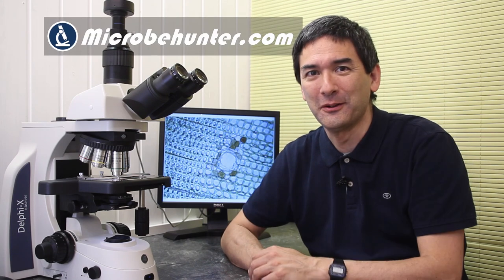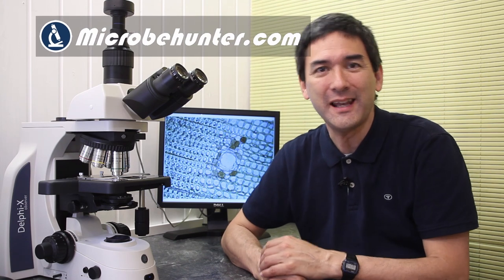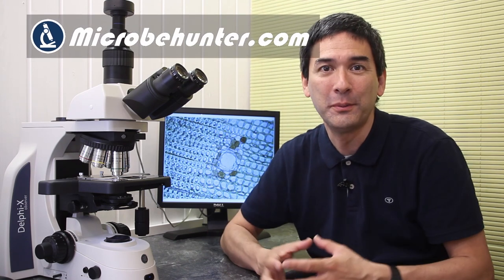Hi, hello and welcome again. Microbe Hunter here. And this microscope here, look at this one. This is the Delphi X Observer Microscope from the company Euromax. And today in this video I'm going to have a very detailed look at this microscope. It's a very good one. And I would like to thank the company Euromax for having made available a microscope to me so that I'm able to make this review video.